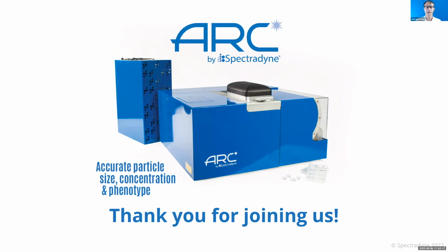multiple events at once. With the ARC, however, remember we're detecting particles with MRPS, and so we have a very physical measure of the particle characteristics as they go through the constriction, the size and concentration. So just like if you're running on the NCS1 and the concentration is too high, you can see that very directly in the raw data because particle events are very close to each other in time, and they start overlapping with a reasonable frequency. So we should be able to avoid that situation pretty well on the ARC.